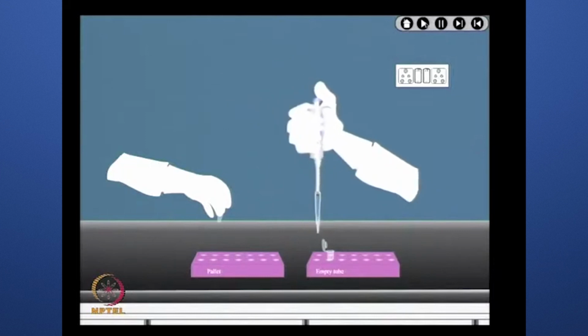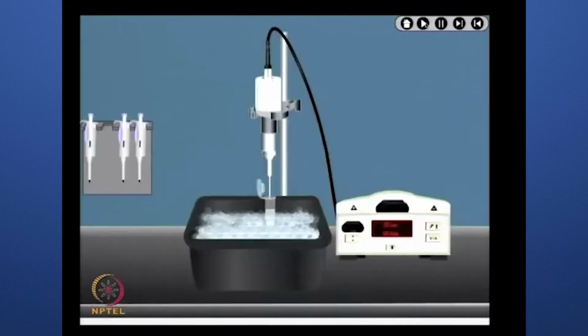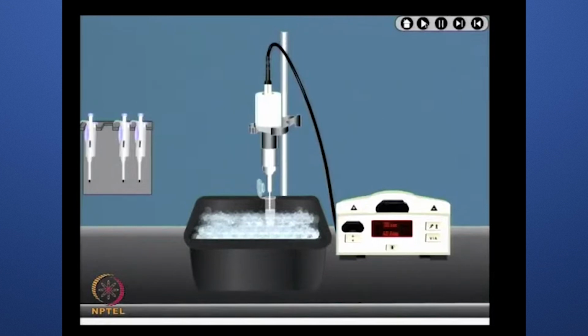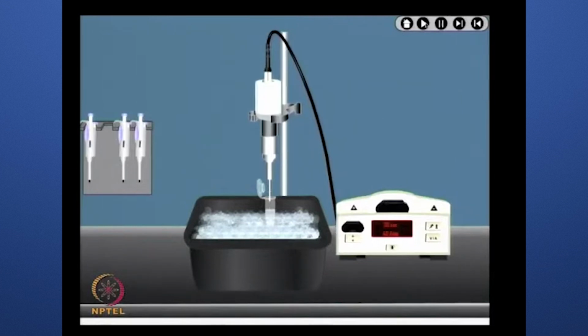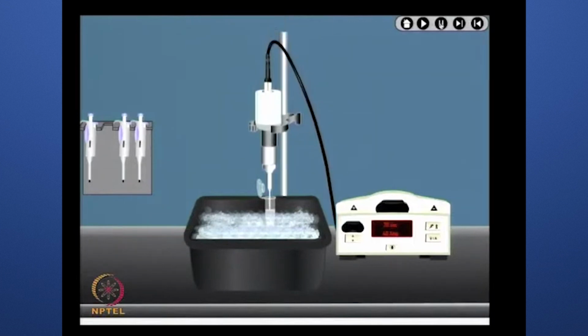Wash the bacterial pellet with phosphate buffer of pH 7.4 for 4 times to remove the media. Resuspend the pellet with protease inhibitors and lysozyme, and cells can be further ruptured by sonication in ice to prevent foaming and heat.